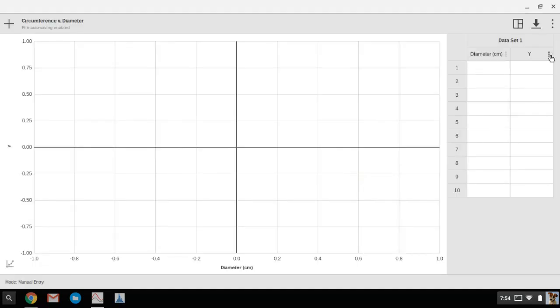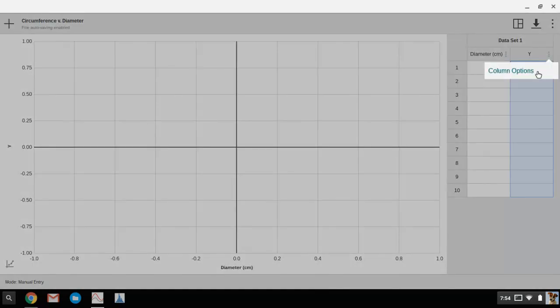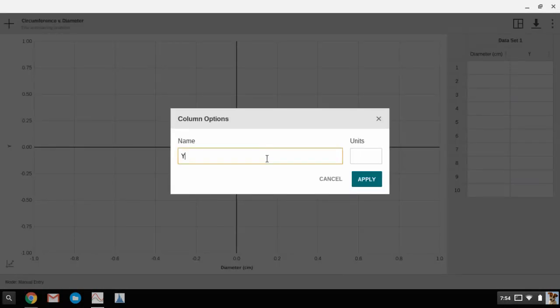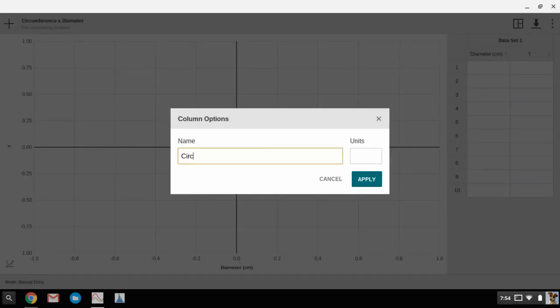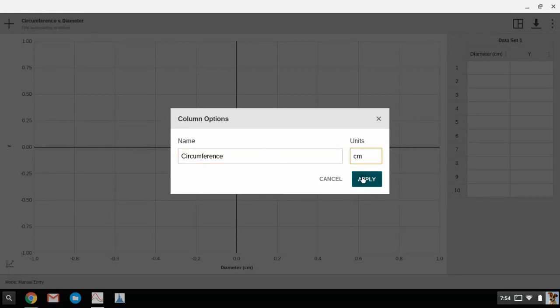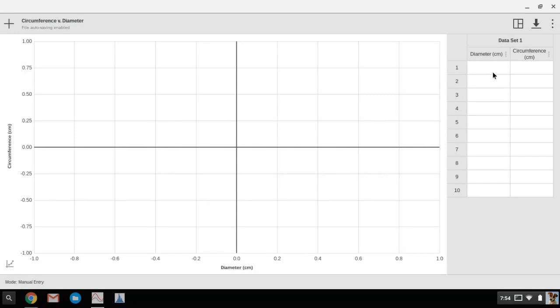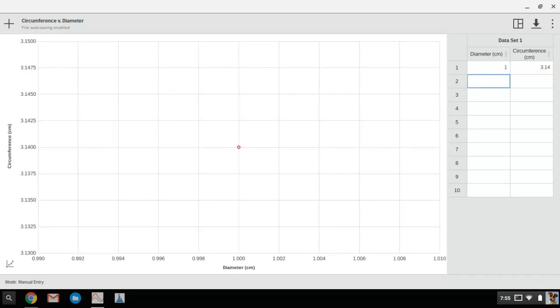And then you can do the same thing for your dependent variable or what's being plotted on Y, which for me is circumference.